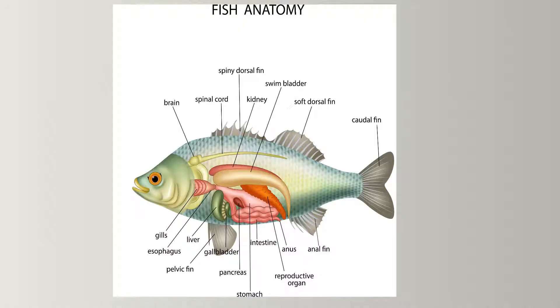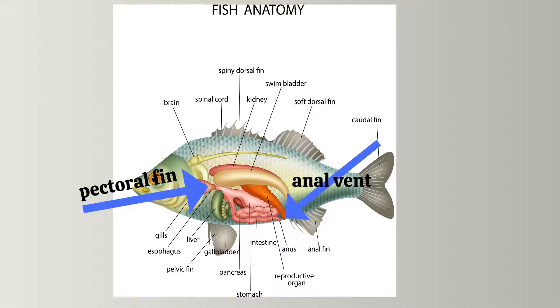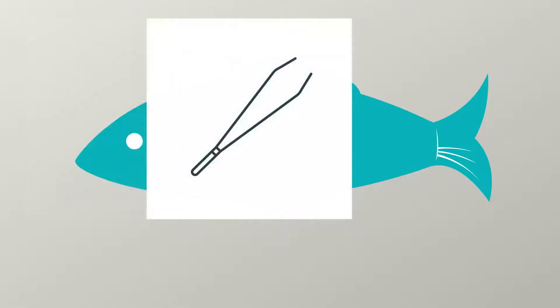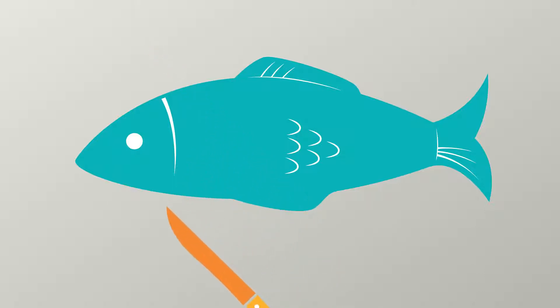So you got your fish — now what? First thing to do is to find the pectoral fins. These are the fins on both sides of the fish. Here you'll find a set of bones stretching from the spine to the belly. Next, you need to look at the underside of the fish and find the anal vent. In between these two points is the fish's stomach. You need to be very careful to make sure you don't cut anything you shouldn't be. Get a sharp knife and some tweezers ready. Put on a pair of gloves and make your first cut from the anal vent all the way up to the gills, making sure not to cut too deep. It's okay if you have to cut a couple of times. Open up the fish a little bit, then cut a line up the side of the fish between the eyes and the pectoral fins so you can clearly see the internal organs of the fish.